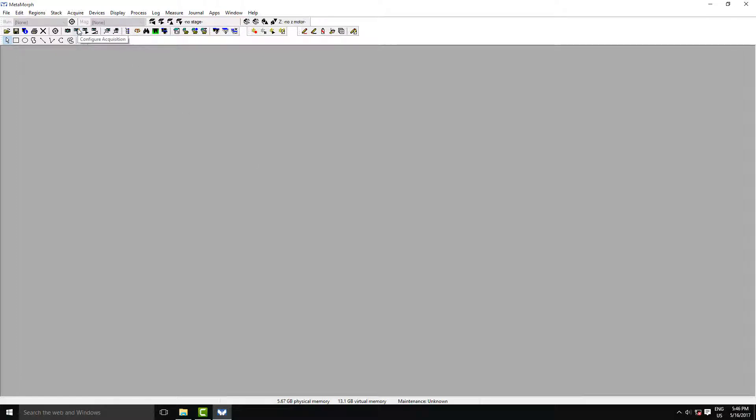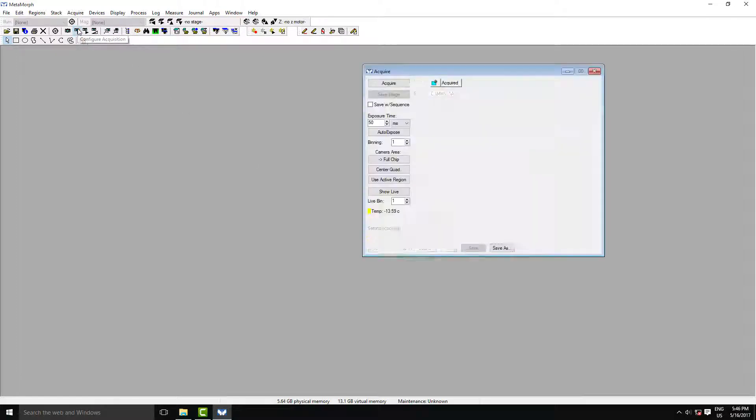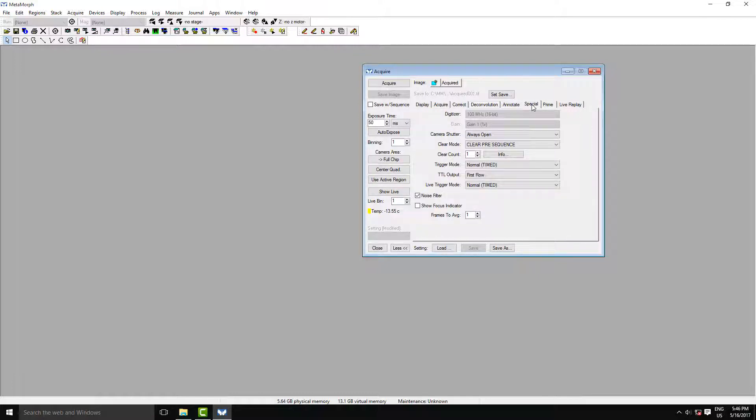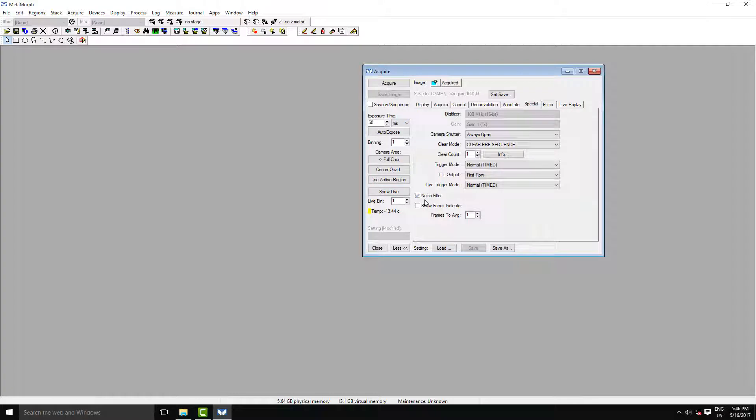If we go to the acquisition settings, you want to make sure you're using auto scale mode for your histogram. On the Special tab, by default, our prime enhance noise reduction algorithm will always be activated when you load Metamorph, but you won't necessarily always want to use that.